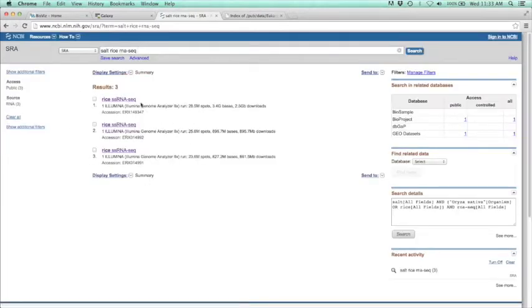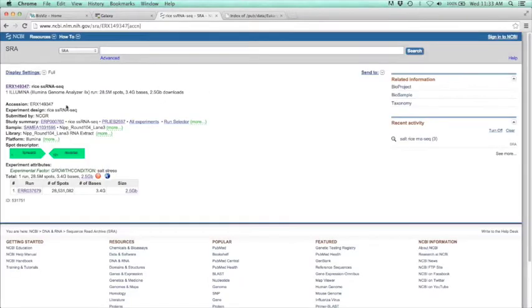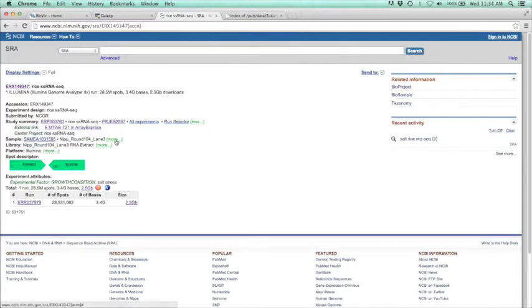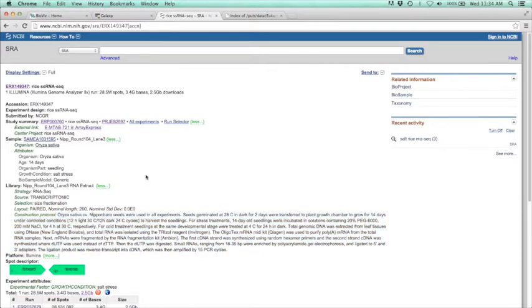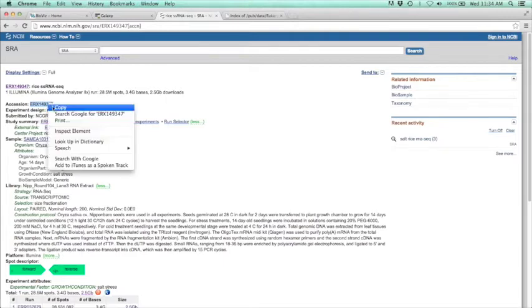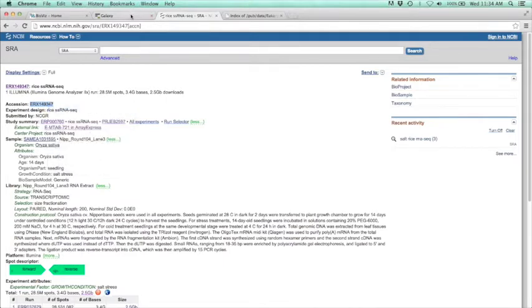We get three results for this. I'm going to click on this first one and expand some of the details. This was done in rice, 14-day seedlings, and this particular sample was salt stress — exactly what I want. There's more detailed methods available here, but all we need from this is this accession number right here. I'm going to copy that and go back to Galaxy.